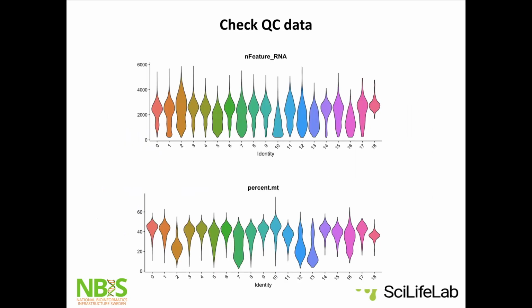Yeah, more examples of what you should look for. Sometimes it could make sense that you have differences in quality due to it being different cell types. Sometimes it will be technical artifacts, and to know which is super hard. So it's a combination of also a bit of experience, that you know which cell types are smaller, which are bigger, which you expect to have more mitochondria, less mitochondria, really knowing the biology of these cells and what might make sense.